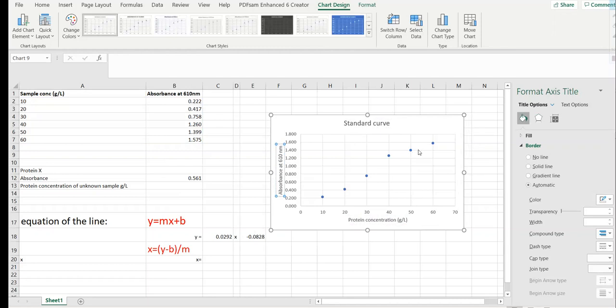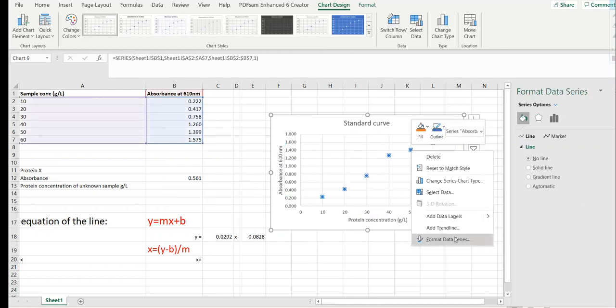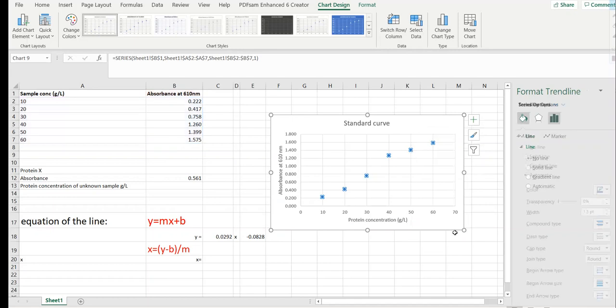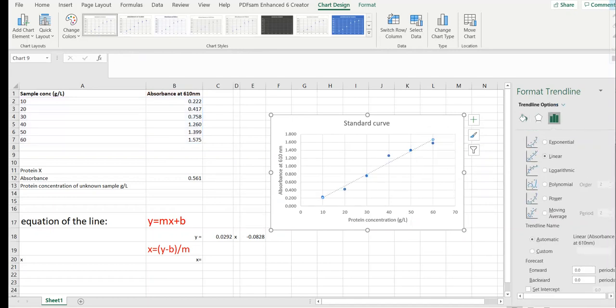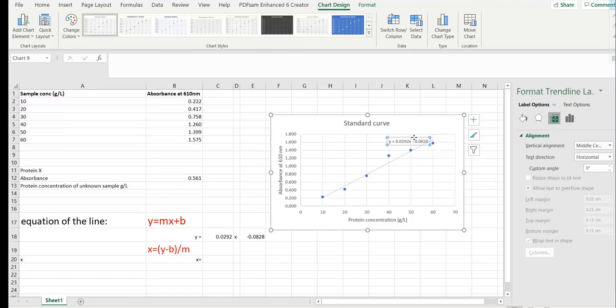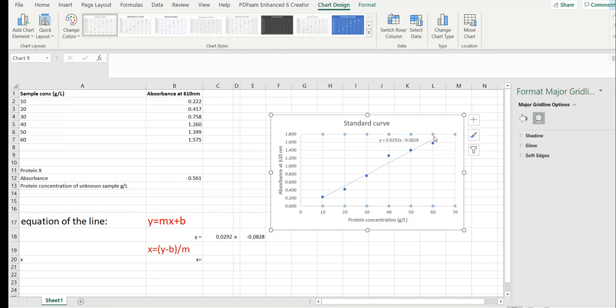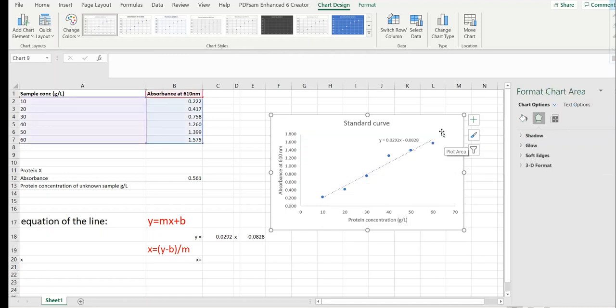Then you select the dots, right click, add trend line. This format trend line section will open, scroll down and display equation on chart. So this is the equation of the line that is needed to find the protein concentration. You can clear these to make the graph look better.